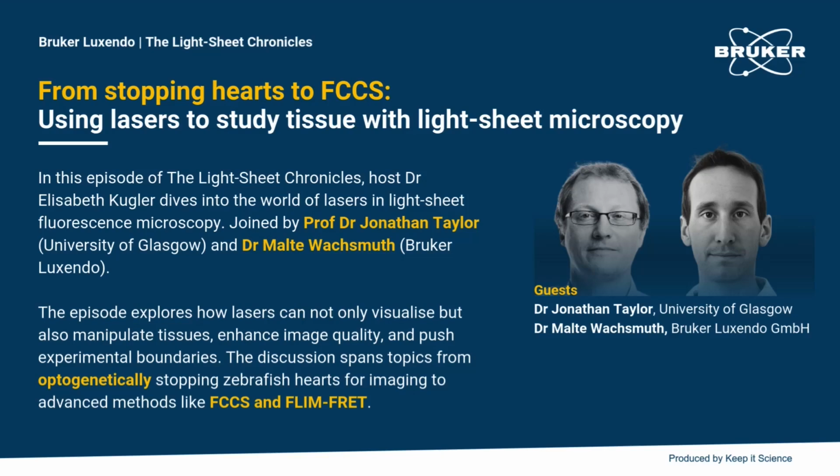But actually, I think it's a great sign of a mature technology, almost on a par with confocal, that this has been largely replaced by user workshops of biologists who are applying this tool to answer their questions on their own, if you like. And so, I'm excited for the technological, but also the biological applications that are coming out from what's now a very mature field.